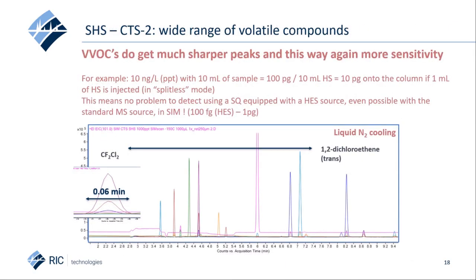A small calculation here is made for a water sample at the 10 ppt level. When assuming full headspace presence of the volatiles and taking standard conditions for headspace with on-column refocusing, so 1 ml injected in splitless mode, we arrive in the sensitivity range where state-of-the-art mass specs easily detect these absolute quantities. Low ppt level with static headspace has become standard.